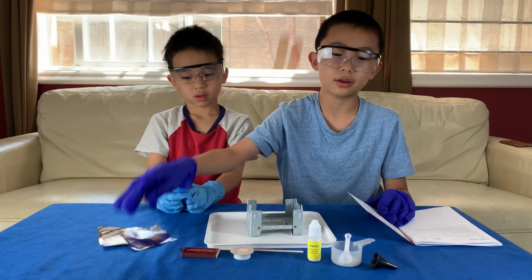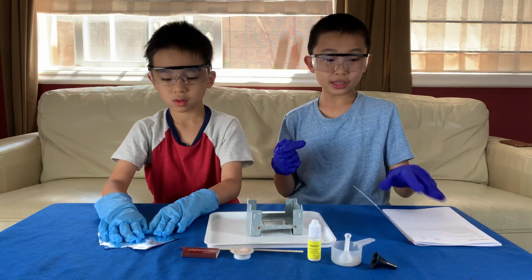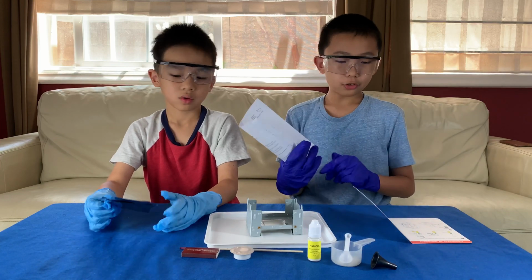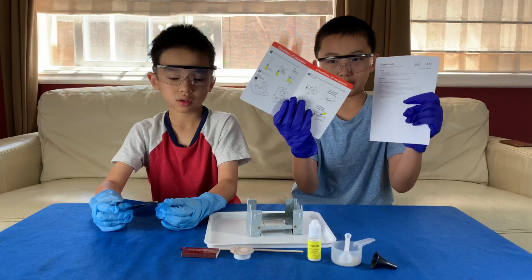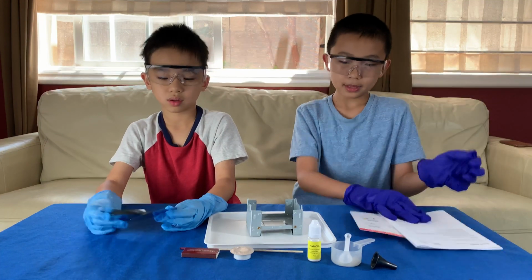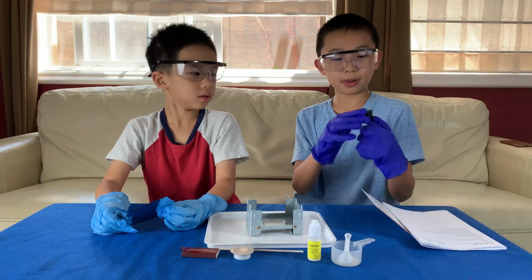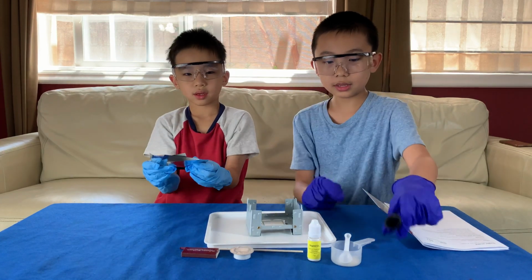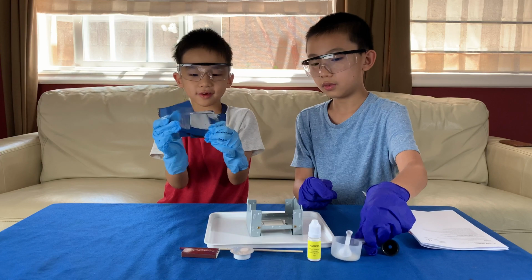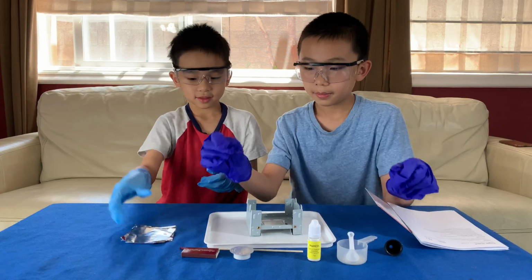Okay, so for this experiment, I'm going to be using step-by-step instructions on here as well as on here. So we have double instructions. Also, what we have is a small funnel to pour things in. 3 pieces of foil that they gave us. Matches.